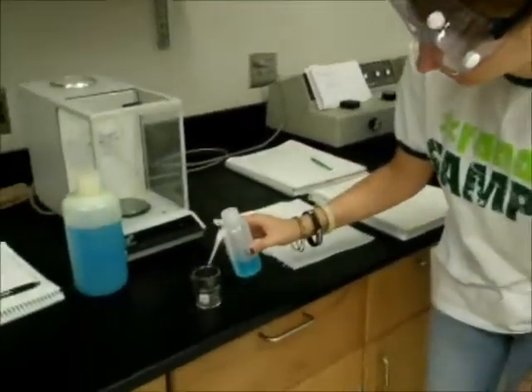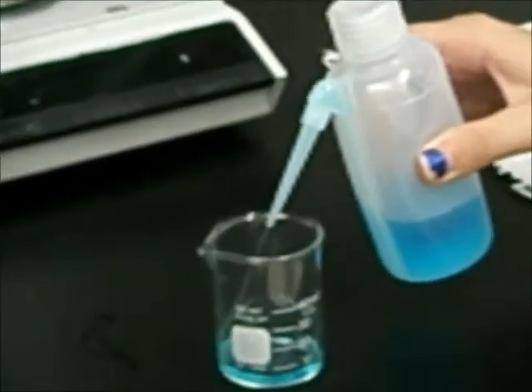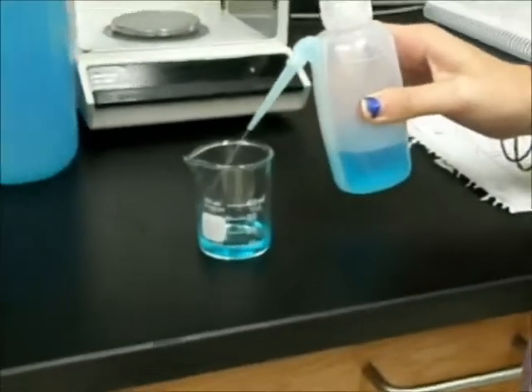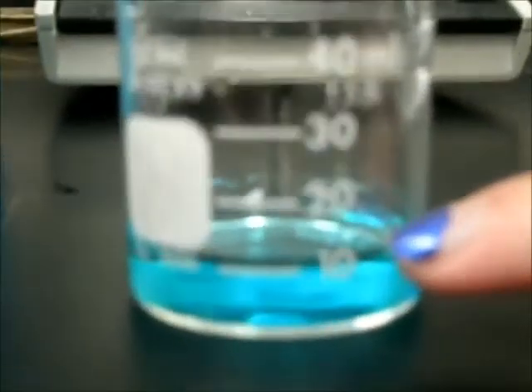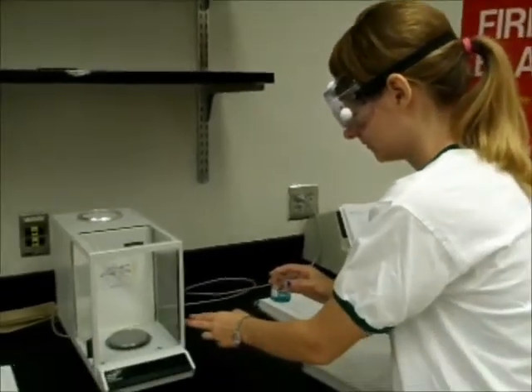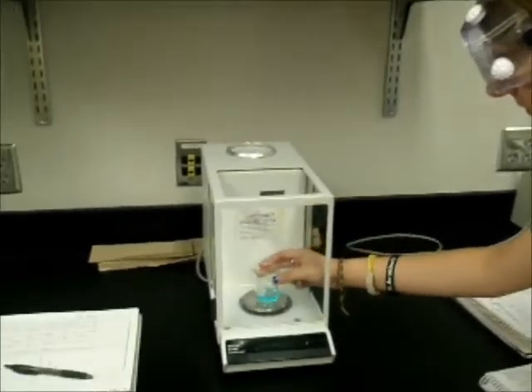She removes the beaker from the balance to add the solution. She puts 10 milliliters of water into the beaker. Now Jessica places the beaker with the solution into the analytical balance and reads off the measurement of 46.18 grams to record in the data notebook.